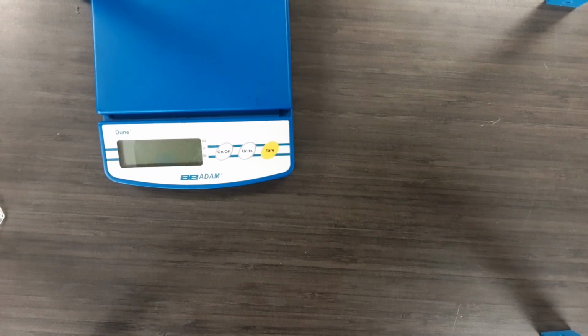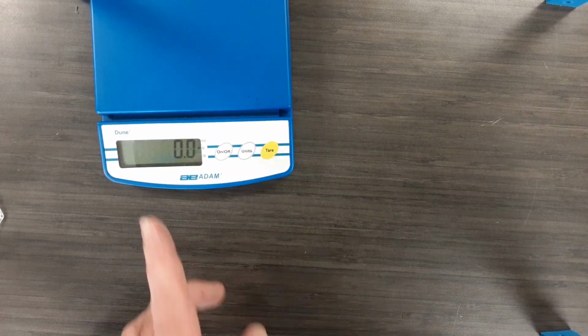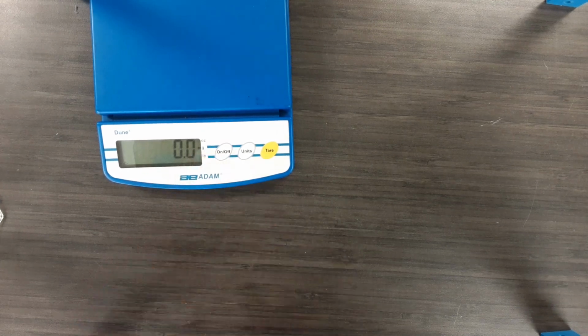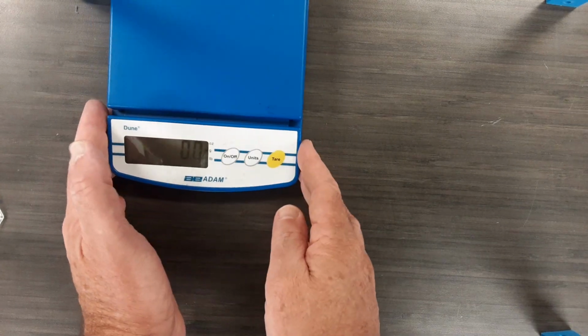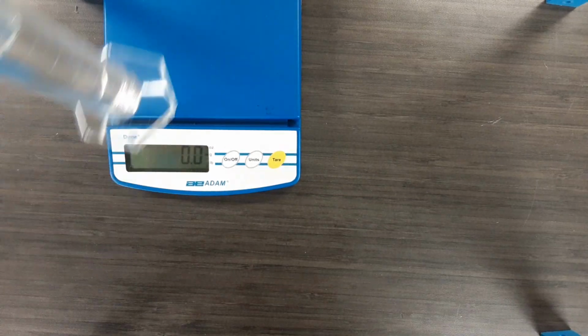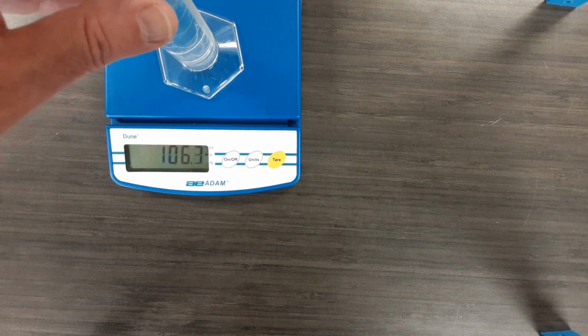Then we took a scale, which our textbook calls a balance, and we used it to find the mass. And remember, if you're using this as a balance, we need to measure in grams. There's a little arrow there pointing at grams. If you use another unit, our calculation doesn't function. So we got the mass of the water and the graduated cylinder, and we recorded that.